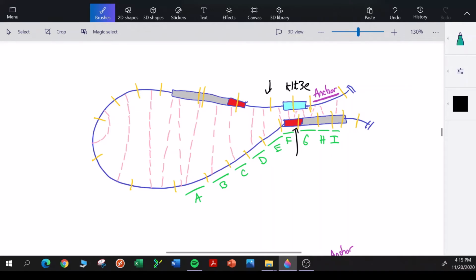Now I have all these little orange lines representing where the BstYI restriction enzyme is going to cut. And these pink lines are the hypothetical formaldehyde crosslinks that were formed between the various chromatin segments when the cells were treated with formaldehyde.